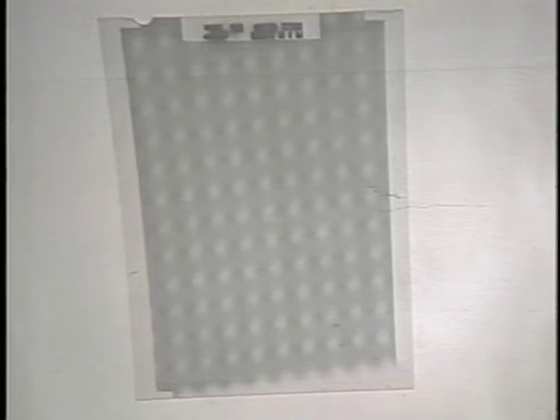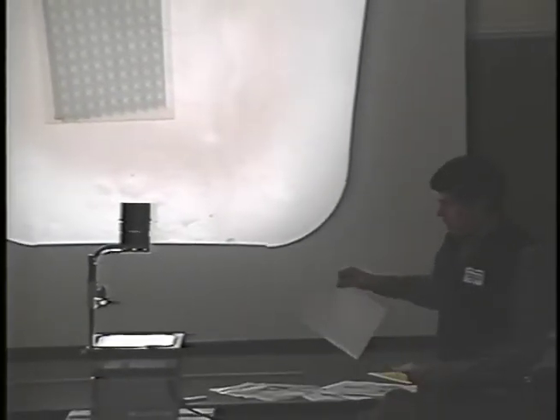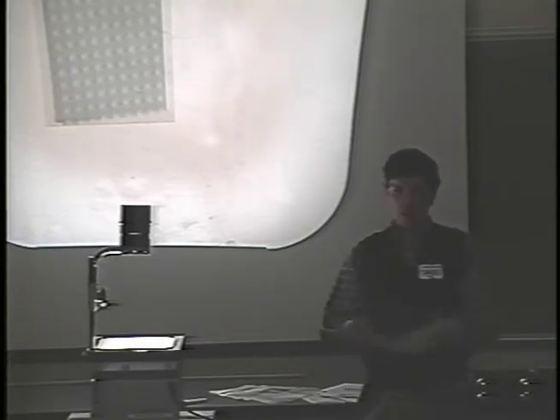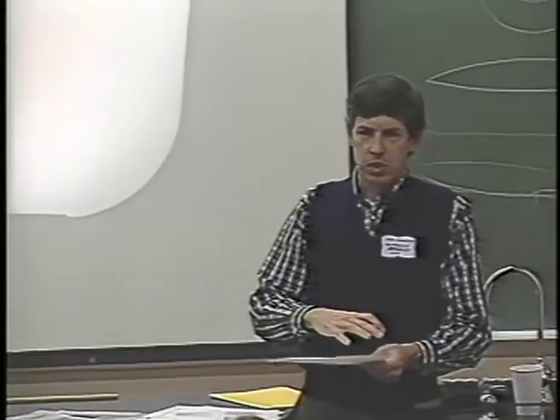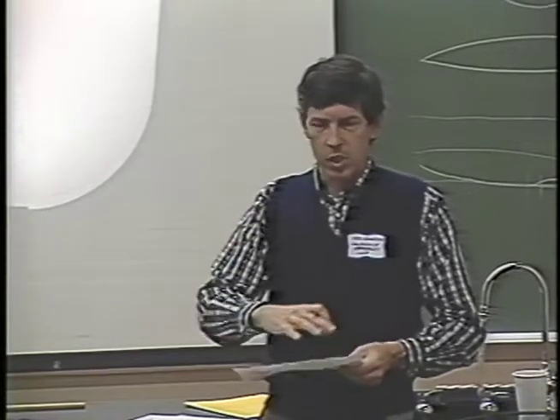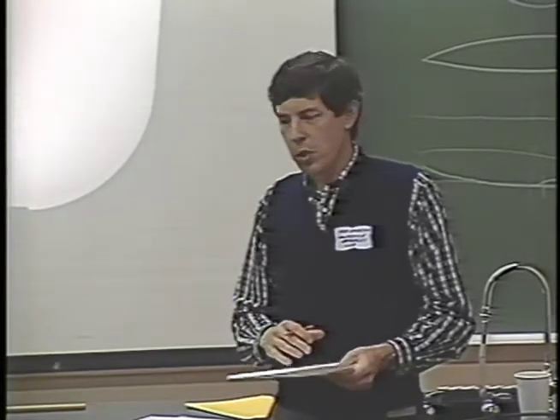The reason to do spot scan imaging to begin with is to reduce problems that are caused when the electron beam shines on the specimen. All this electron beam damage we're causing to the specimen causes the specimen to probably go through some kind of a motion like this, something like a flag waving in the breeze, as the beam causes damage sites at different positions, and bonds are changing and breaking, and interatomic distances are changing.